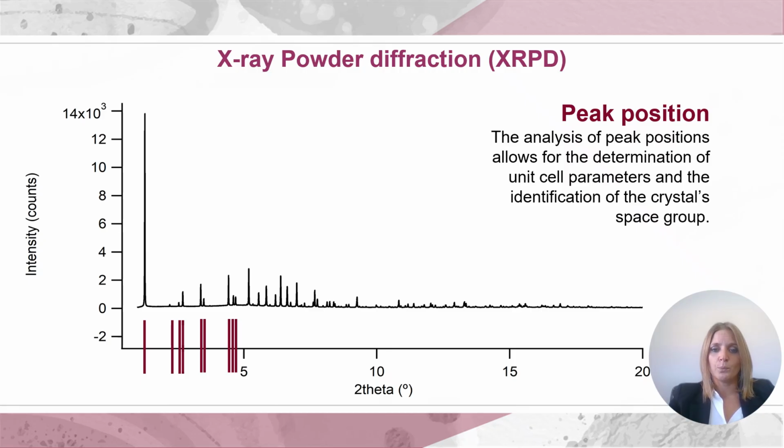So basically, with our diffractograms, we can obtain the cell parameters of our sample, and any little shifts in 2 theta of our powder patterns mean that we have changes in the cell parameters, maybe due to thermal expansion, some chemical substitution, or stress. So it's really important to calibrate your instruments to have an accurate calculation of these parameters.